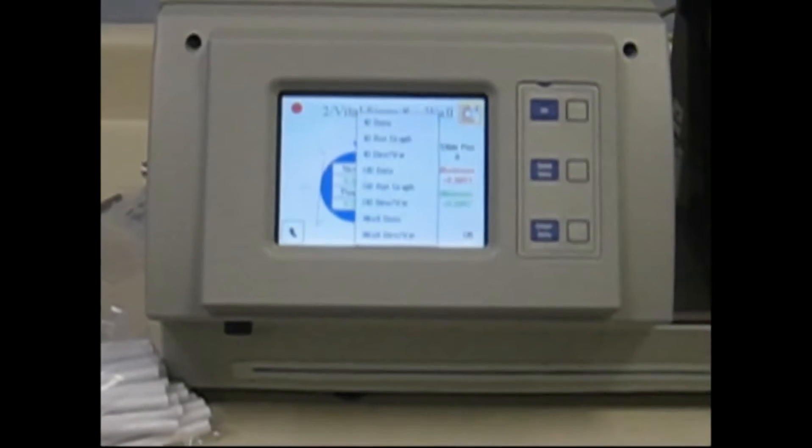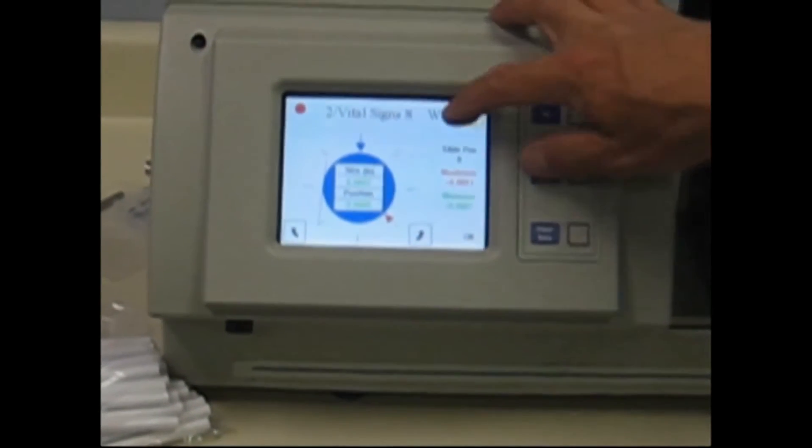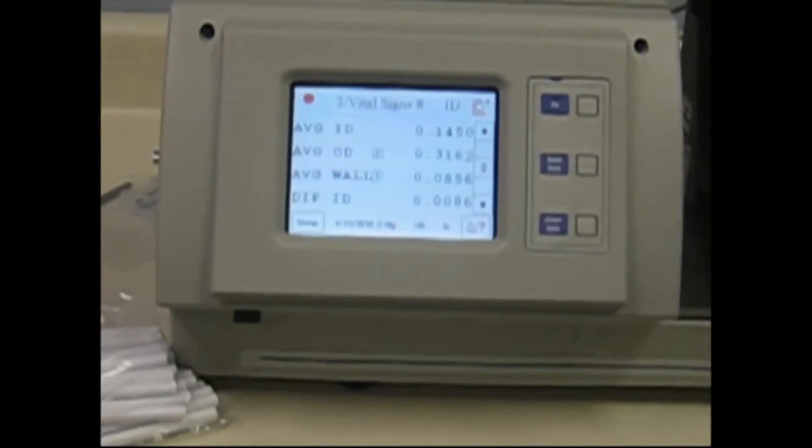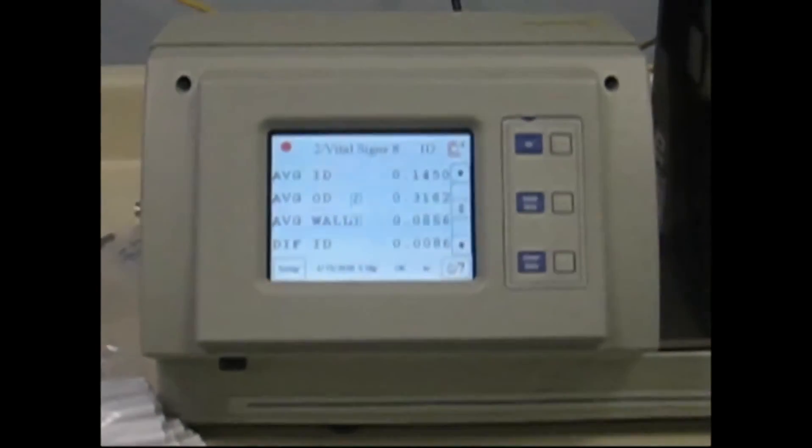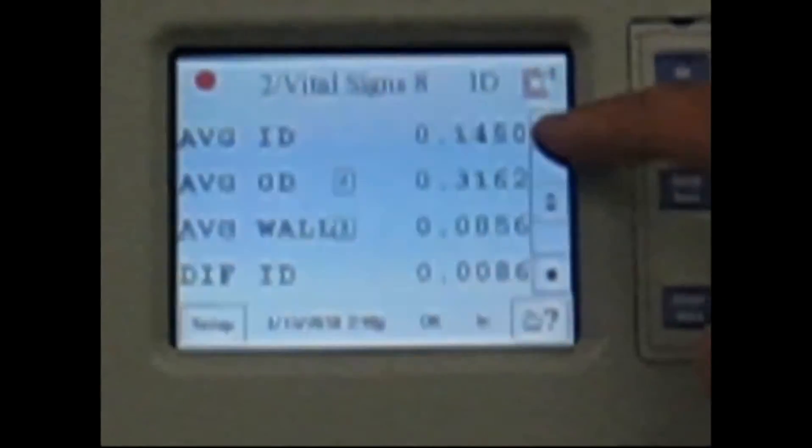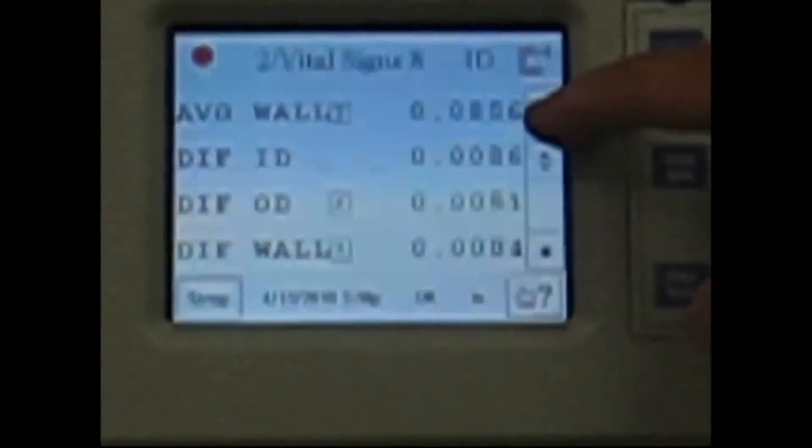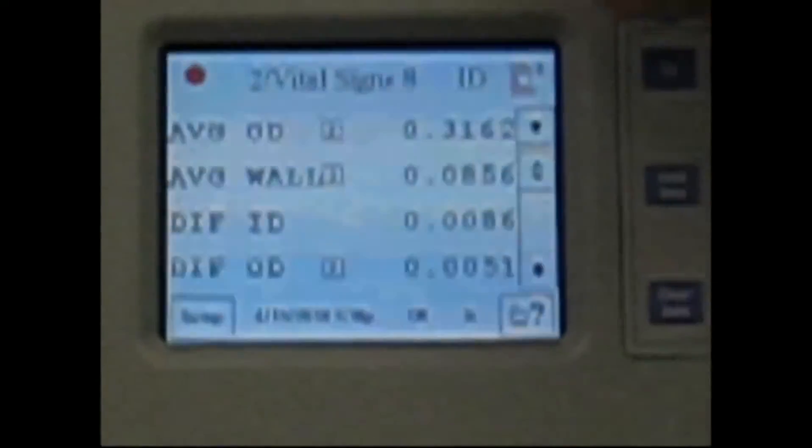You can use this tab here to go and interrogate all of the data. You can go and look at the ID data, and the ID page actually will show all the averages here: average ID, OD, wall, etc. And you can scroll through those settings to look at the max, min, and difference.